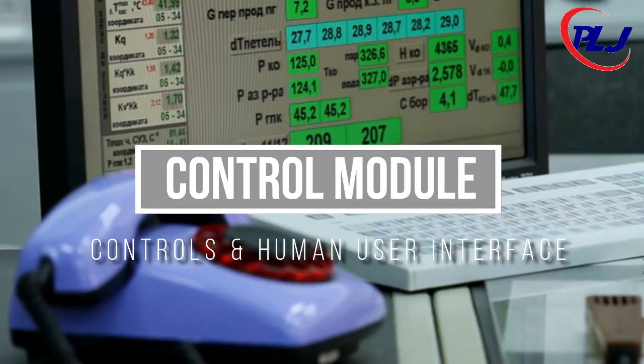Control module. In the control module, we will be discussing how to access and control the pH, DO, temperature, and other parameters, data tracking, and general settings.